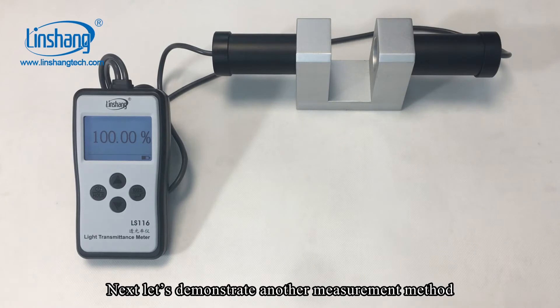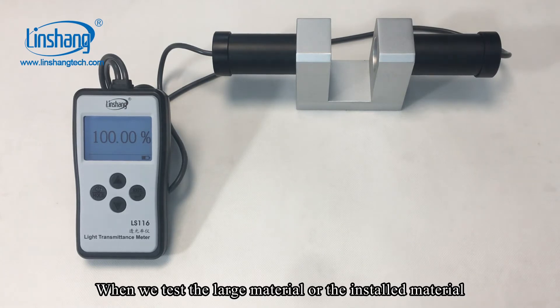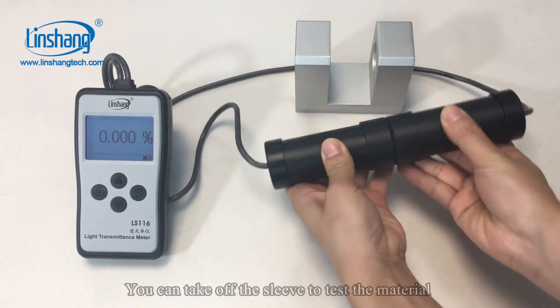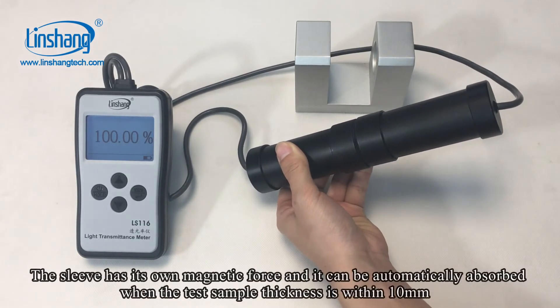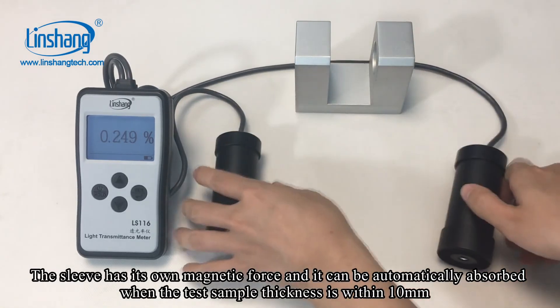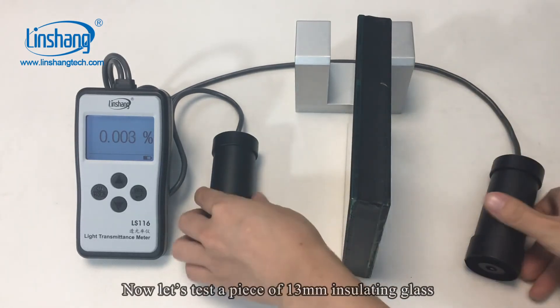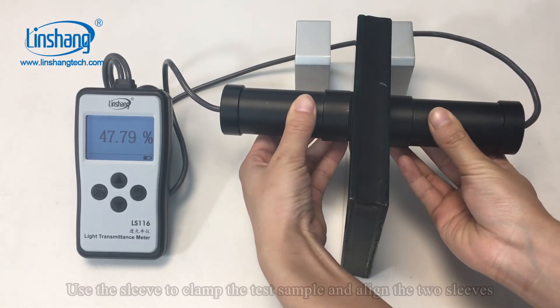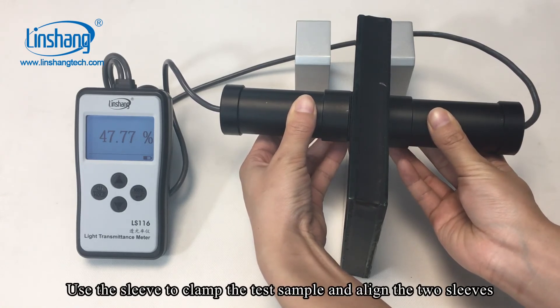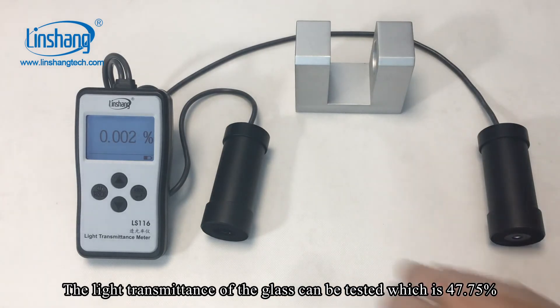Next, let's demonstrate another measurement method. When we test large material or installed material, you can take off the sleeve to test the material. The sleeve has its own magnetic force. Now let's test a piece of 13mm insulating glass. Use the sleeve to clamp the test sample and align the two sleeves. The light transmittance of the glass can be tested, which is 47.75%.